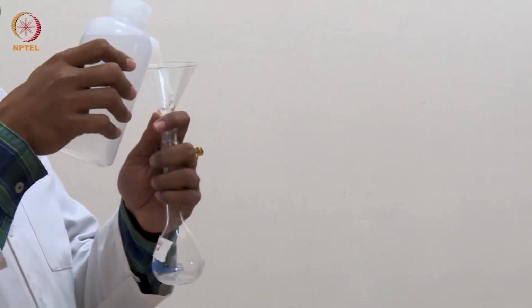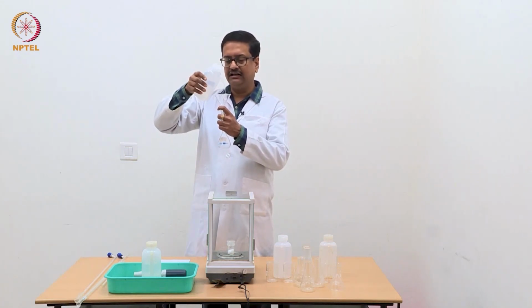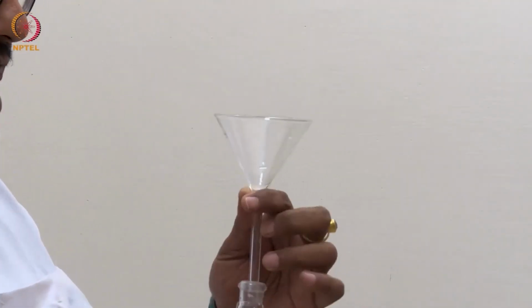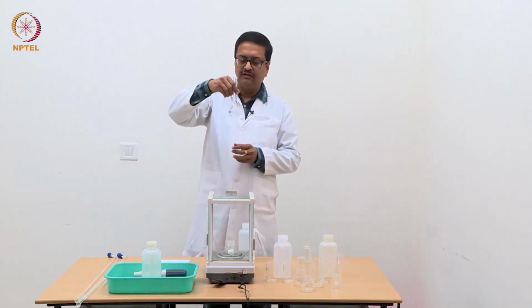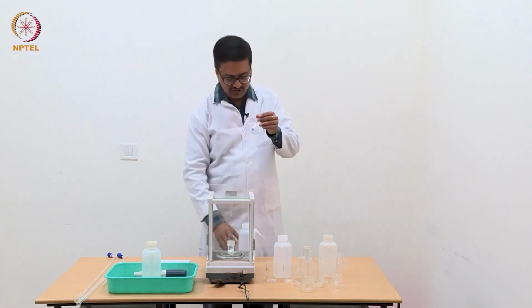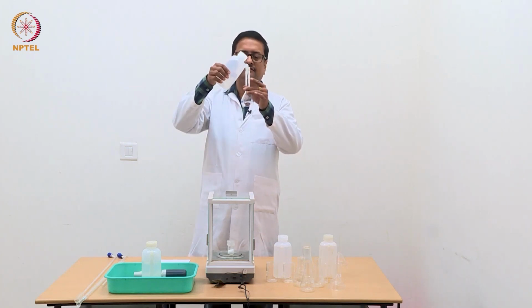So, let us now first dissolve this using distilled water. So, first I am washing the funnel so that we do not leave any oxalic acid in this funnel. Then one can remove the funnel from the volumetric flask. Try to dissolve the amount of oxalic acid that I have taken using this water. We can add more water, making sure that we do not overshoot the mark, which tells me that that is my 100 ml.